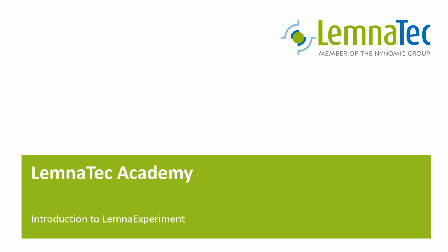In this video, we will have a first look into LemnaExperiment. I will explain all the sections and pages of the software as well as some basic concepts. This video will be based on version 24.11 of LemnaExperiment. If you use another version of LemnaExperiment, your experience may differ in parts.